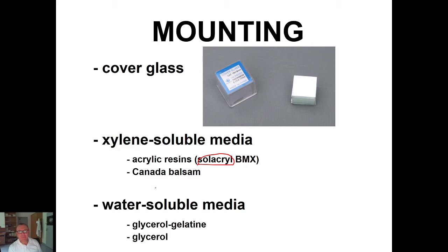And when well done, the specimen which is covered by cover glass in Solacryl and which is well dehydrated and well stained can be taken as a permanent specimen. It can be observed many times, it can be stored for many years, and if well stored in dark, it can be still used for new and new observation.